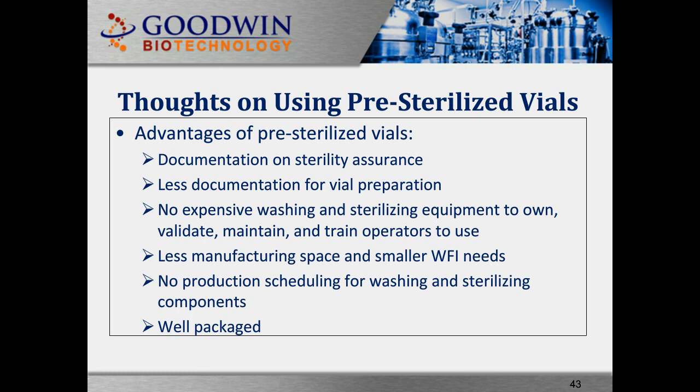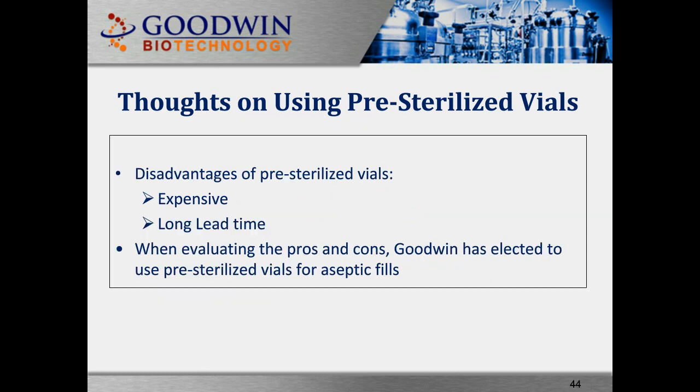And pre-sterilized vials are well packaged. There are a few minor disadvantages: pre-sterilized vials are expensive, and at times we have a long lead item. By evaluating the pros and cons, Goodwin has elected to use pre-sterilized vials for aseptic fill.